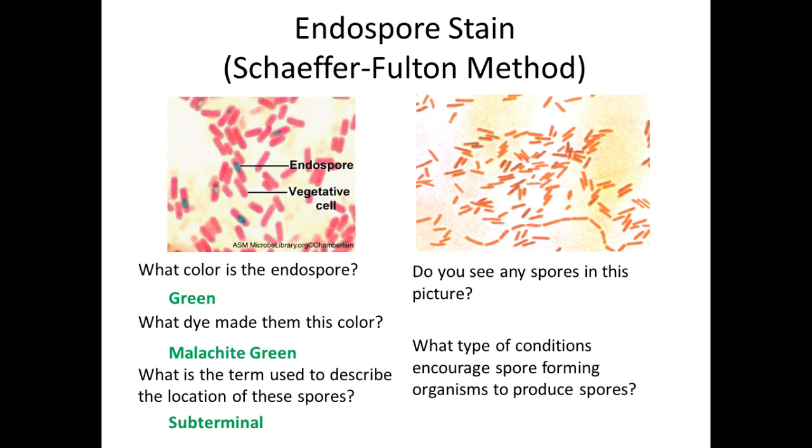So I started these cultures last week. So we should definitely have spore formers. We should have spores in these for you guys to look at. Now, whether we'll actually catch any before the cell deteriorated or not, we might get lucky. So I do want you to scan around and try and find one like that if you can.